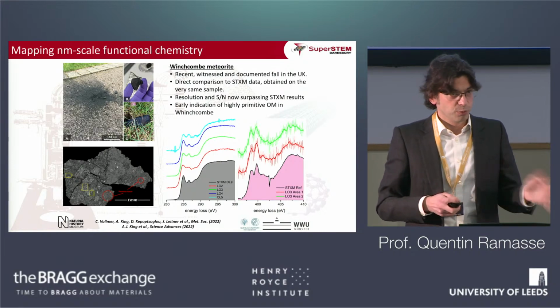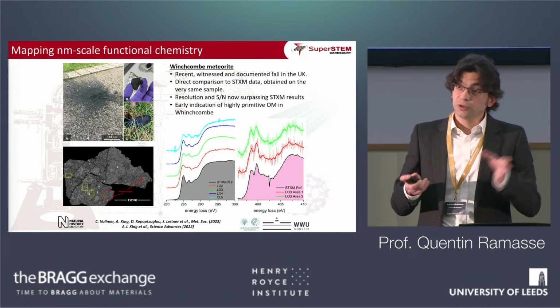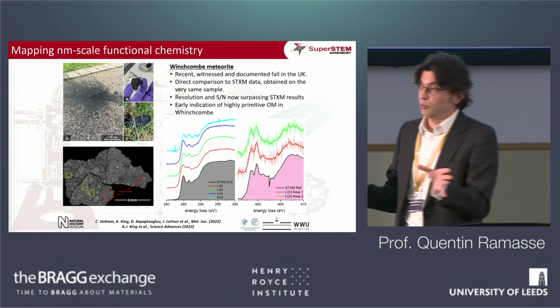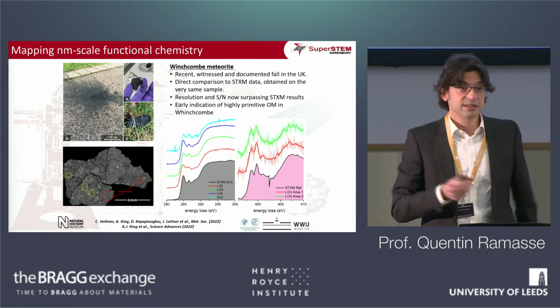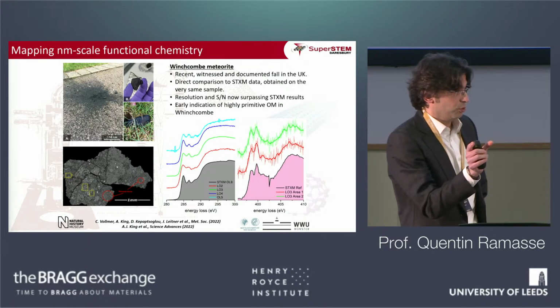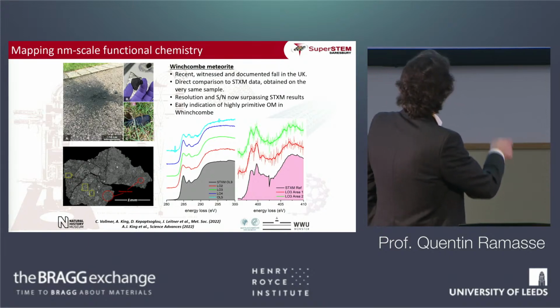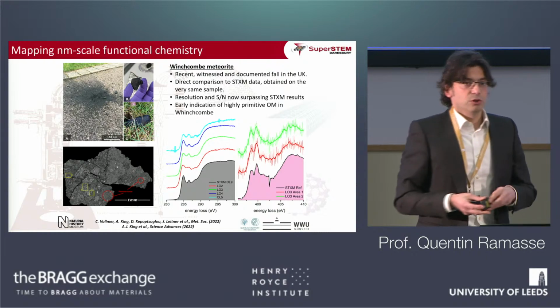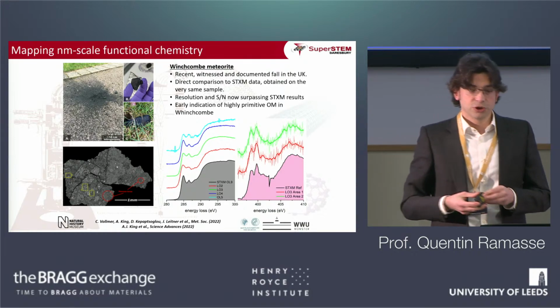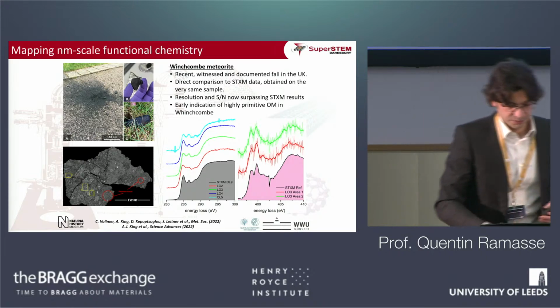I just wanted to show this because I added this slide saying a synchrotron in a microscope, but the point of that particular example was to actually do both synchrotron work and STEM work on the exact same sample. So we took the very same sample, we sliced it up, sent the 1 FIB lamella that was 20 nanometers thick to the synchrotron, and then brought it back to our lab, and essentially we get the similar energy resolution, much higher spatial resolution, and variability across the grains.